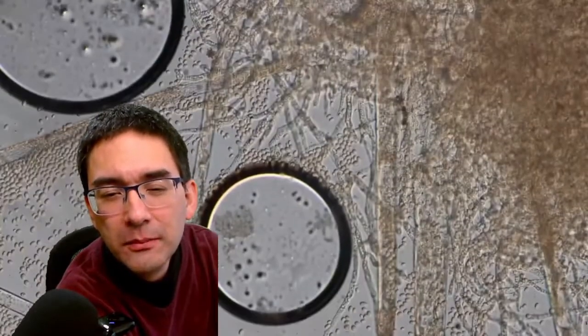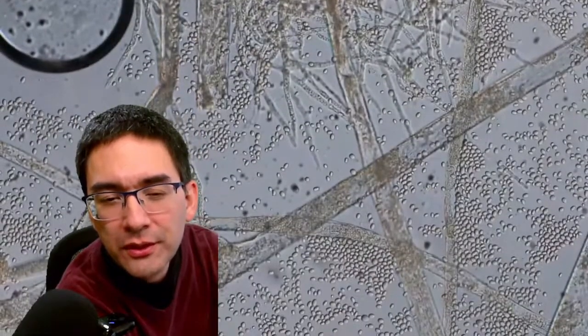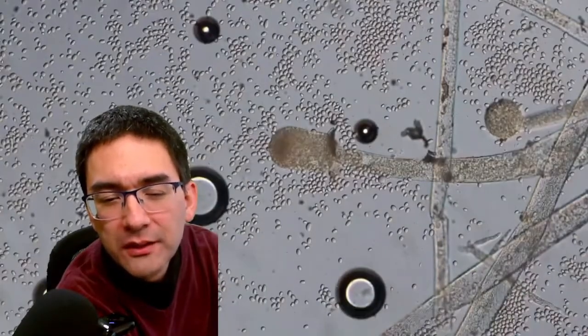And that's now basically the mycelium. The mycelium, these are the cells that actually make up the main part of the fungus. And when it's time to reproduce, then the mycelia will produce those structures here which make the spores.